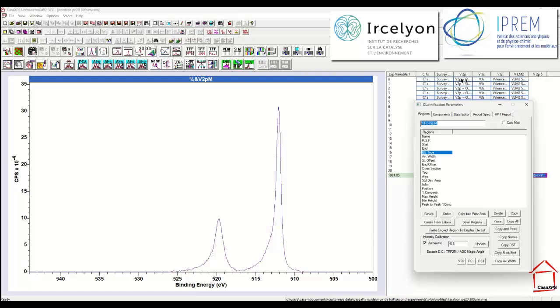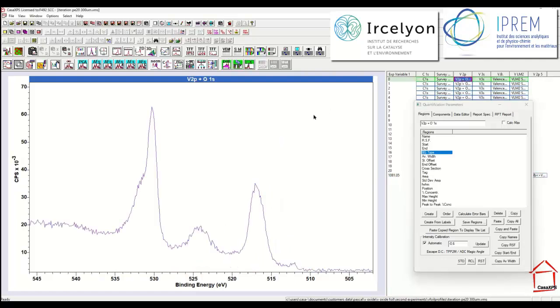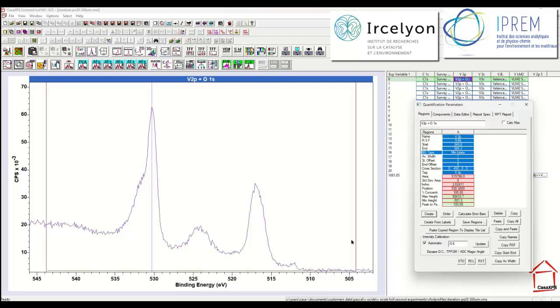So let's do that construction of a peak model, and it will involve a background. We must have a background. There's always an offset in intensity that must be accommodated if we're going to construct a peak model. So I'm going to use, in this case, rather than a Shirley background, a min limits background type. And what that does is it provides me with a constant background that is determined from the minimum of the two limits of the background.